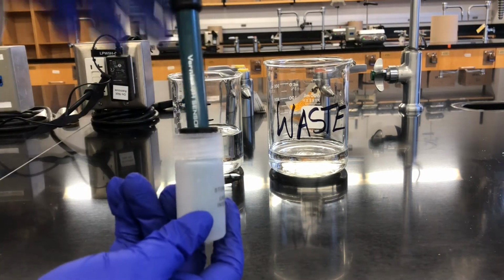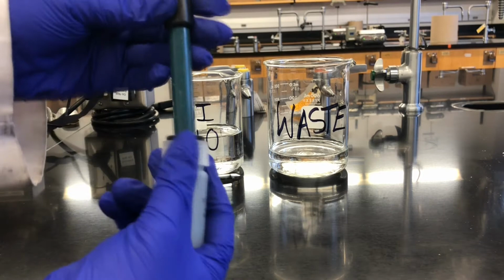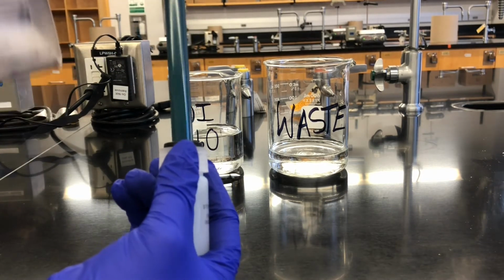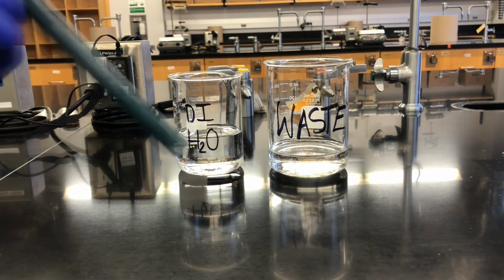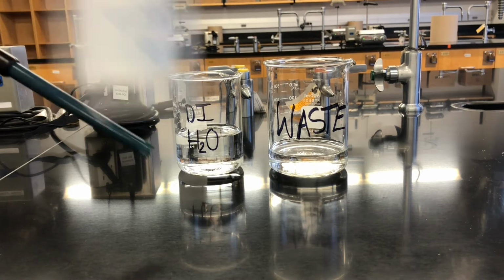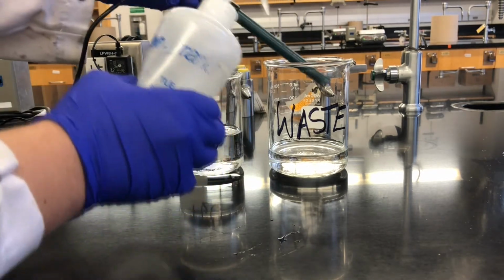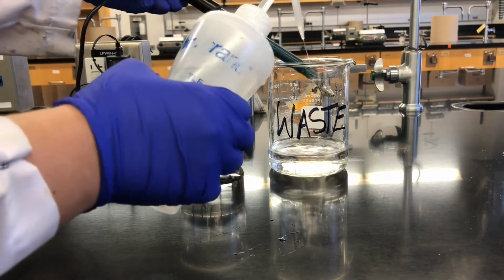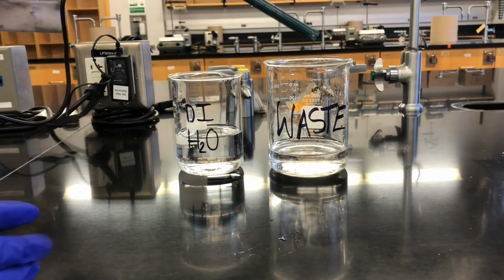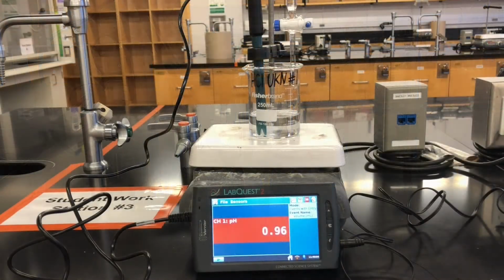Next, we prepare the pH probe for the measurement. The pH probes are stored in a specific solution to prevent them from drying out. To remove the pH probes from the bottle, we first unscrew the cap to open the vial, and then gently pull the cap from the pH probe. When handling the pH probe, it's important to keep it in a solution to prevent the sensor from drying out. We gently rinse the pH probe over a waste beaker before securing the pH probe into our titration setup. With this, we're ready to perform the titration.